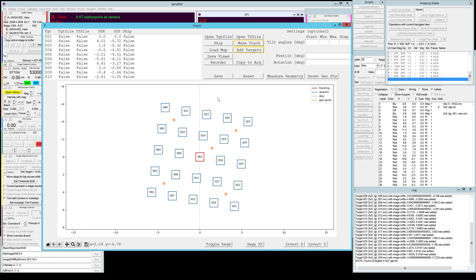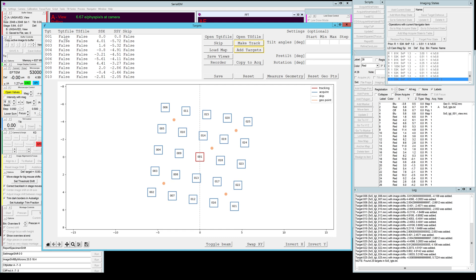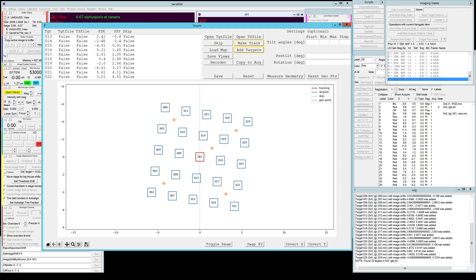You can see on the top left a list of all 25 targets. You can see that there's no target image file saved and of course no tilt series files yet, and you can see all the applied image shifts.